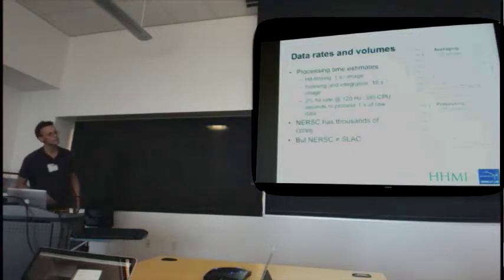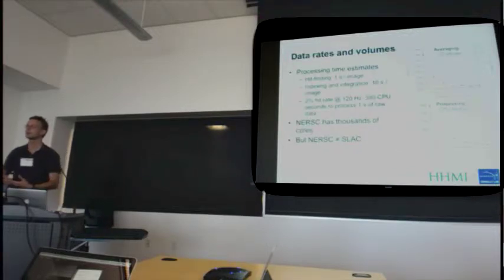So then we started to see the kind of speed up that we were expecting. And it's not always linear. And the reason for that is that it really depends on what we're doing with the data. And there are two extreme cases illustrated here.